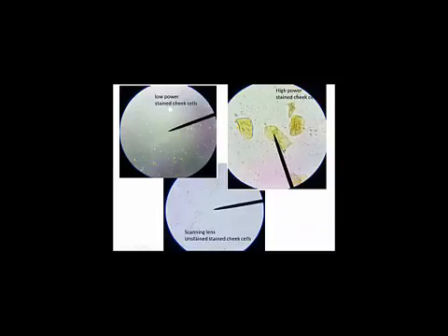This is really blurry. That's not good. This is pretty good, right? I would take this, and these are just not very good at all. Now all of these other dots and splotches, those are either debris that are on the slide itself, or they're actually in the optics of your microscope.